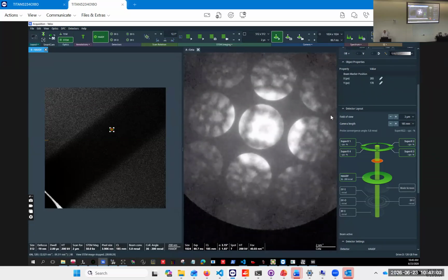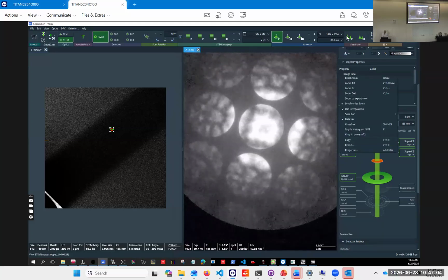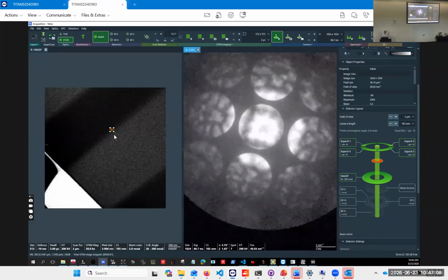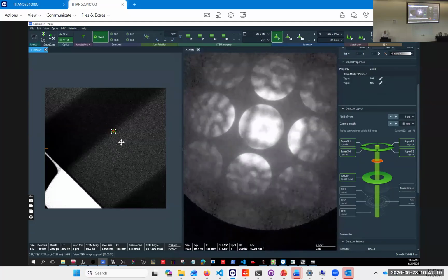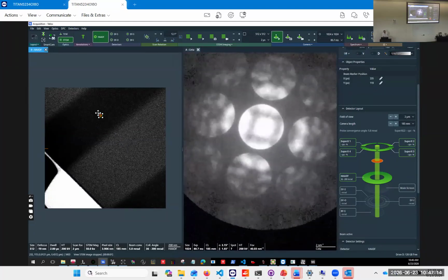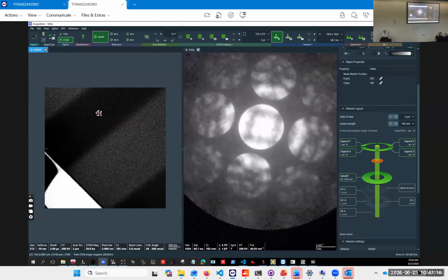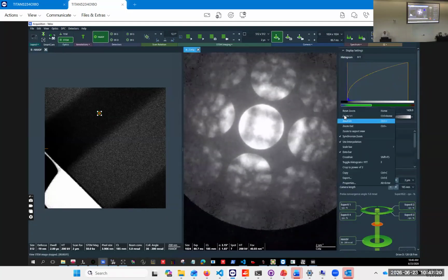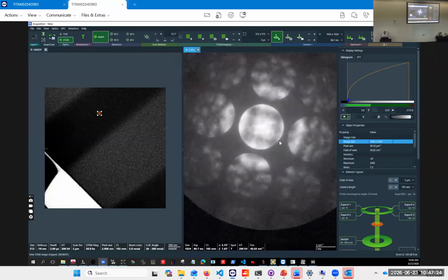That must have moved because of this scan, so I should refresh that. Yep. So we move into the thick part. We have only a single white one. Can we get better? Okay, so barely one thickness fringe here.